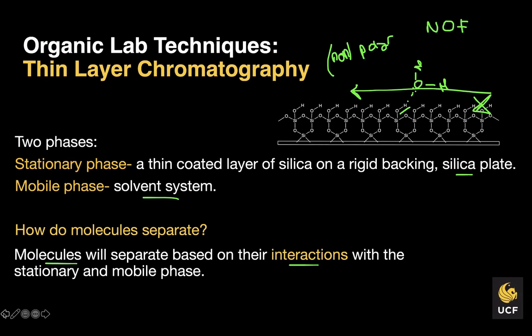There's no absolute measure of how far a compound should go on a plate. That's a completely relative number. All we really want to see is a good separation between compounds that aren't our product and compounds that we believe are our product.